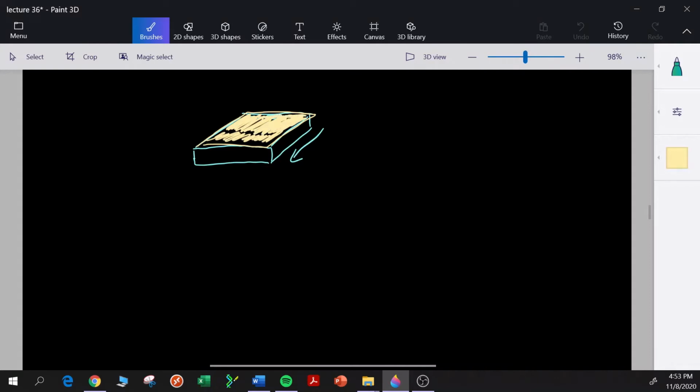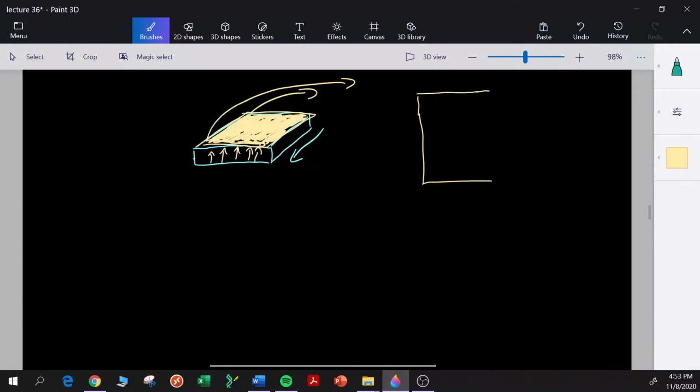It's like a sheet of paper, right? A thin sheet of nylon. So the RNA has already moved by capillary action. The buffer was flowing up, the RNA moved up with the buffer, but the buffer kept going through into the paper towels, and the RNA molecules got stuck. So after about 24 hours, we peel this off, and then we have our nylon membrane with RNA molecules on it.